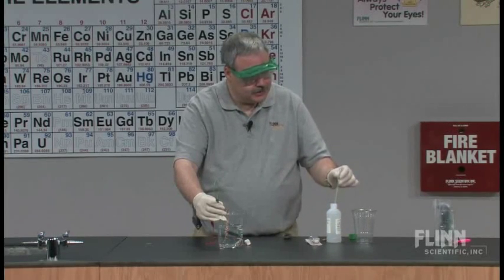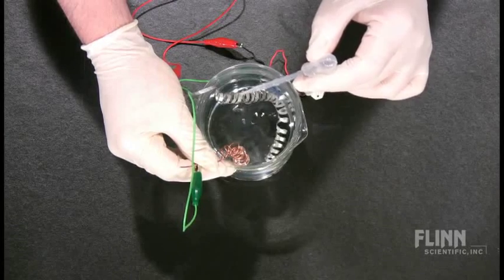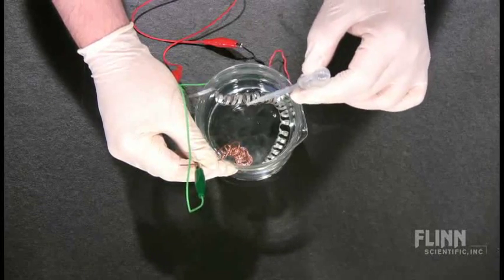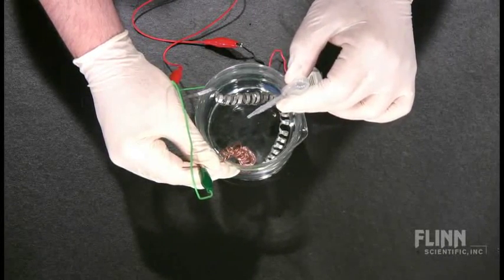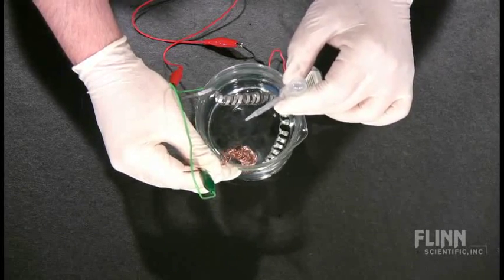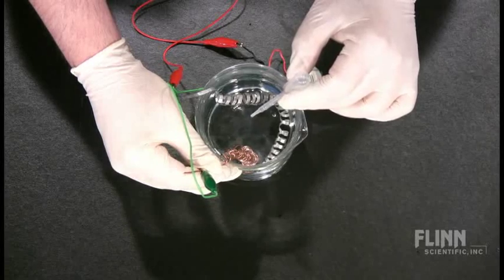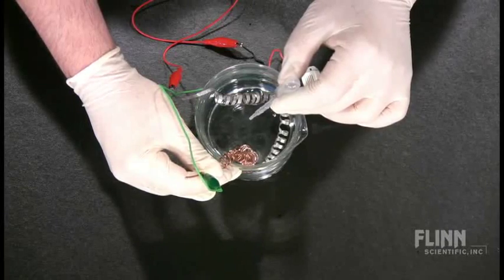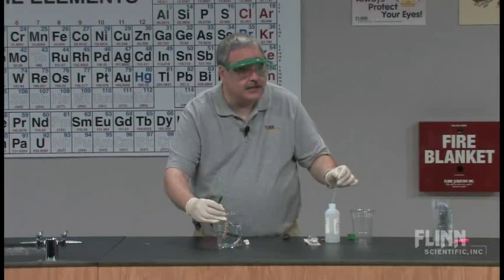Let me add some hydrochloric acid — this is 6 molar hydrochloric acid. I'm dropping it in one drop at a time; it's dispensing itself through the water. And as it dissociates, you get more ions. And you can hear a little buzzing, but as you get more ions in solution, you can hear a definite buzzing.